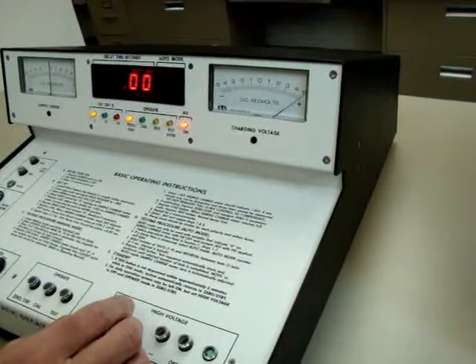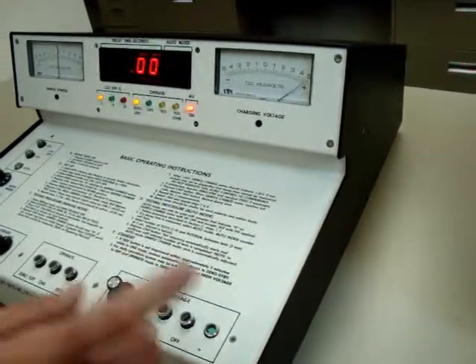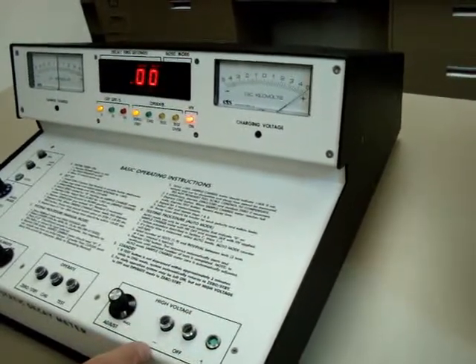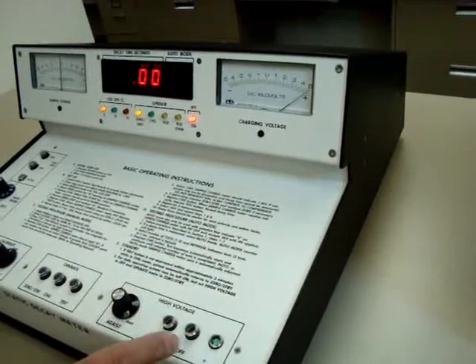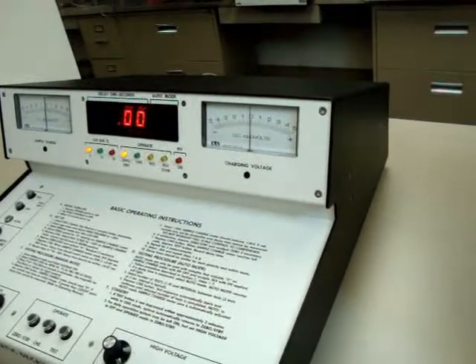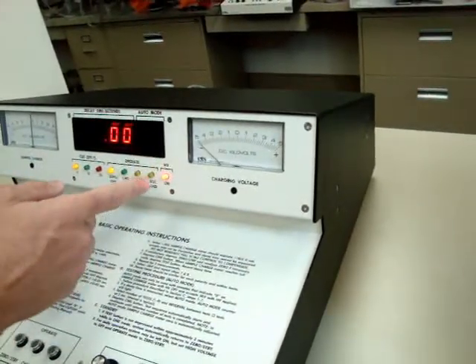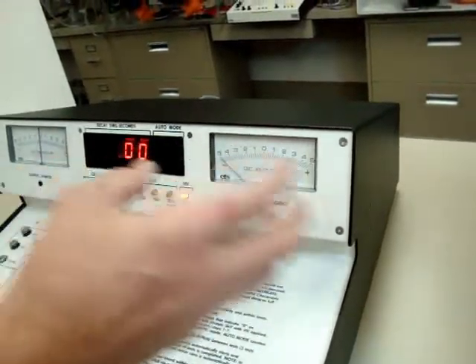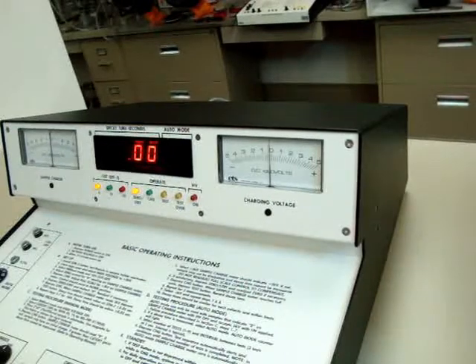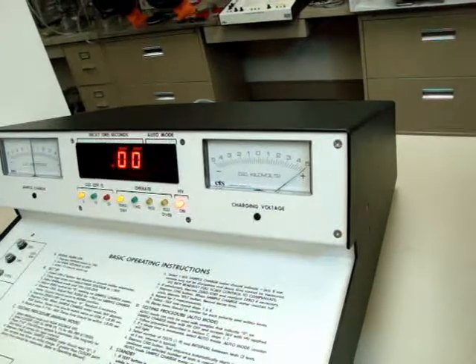We're going to turn it up to about 5 kV, then switch to the negative high voltage just to show that it is working. Before you switch from positive to negative, or negative to positive, always turn your high voltage off first. Notice the negative just goes in the opposite direction — the high-voltage LED is still on, so this is functioning correctly. We're going to turn it off and go back to the positive high voltage, and again 5 kV.